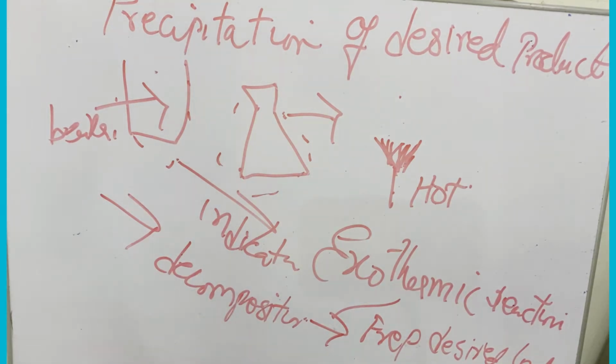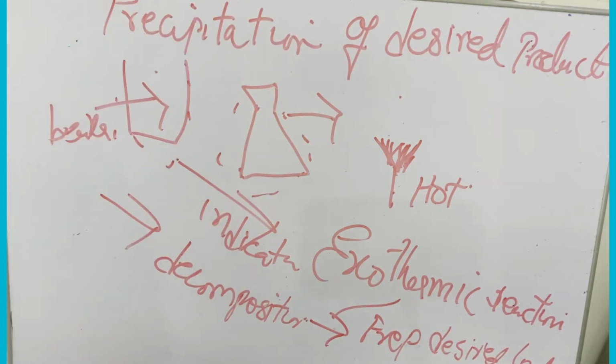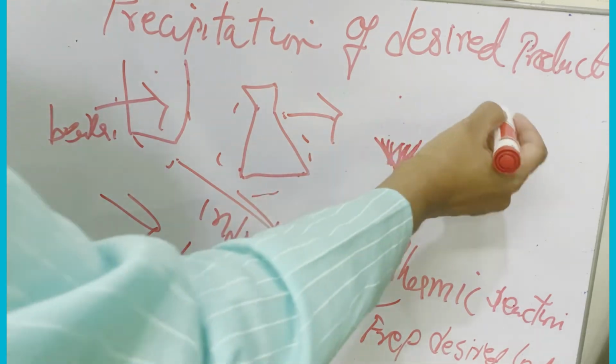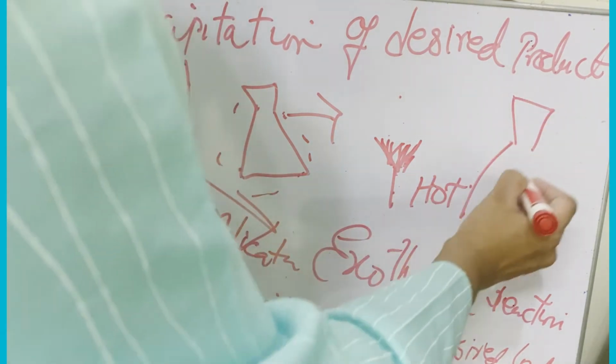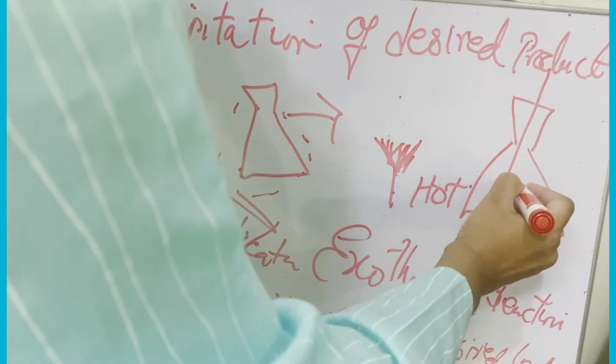That's why the solution inside the vessel is supposed to be stirred constantly with a glass stirrer or a rod.